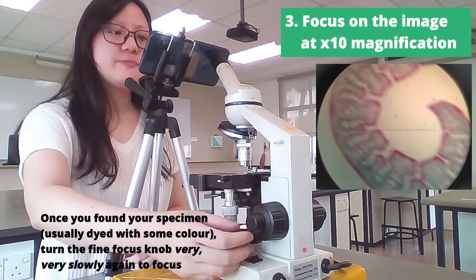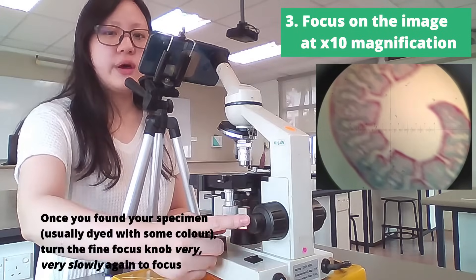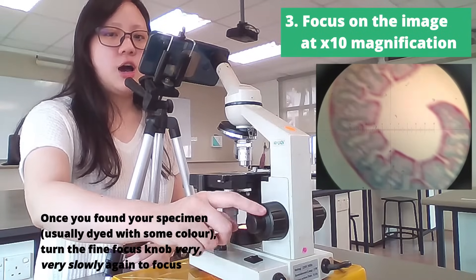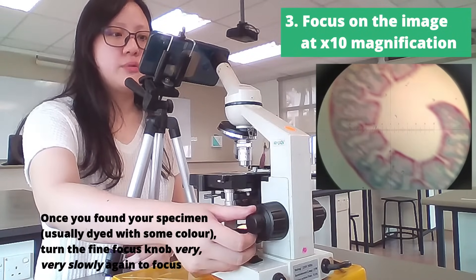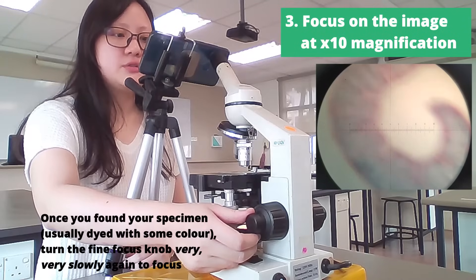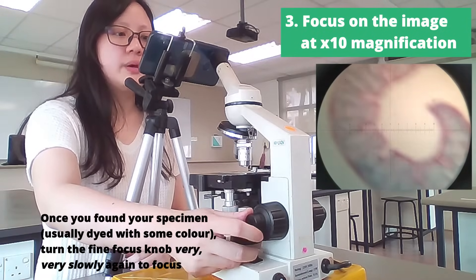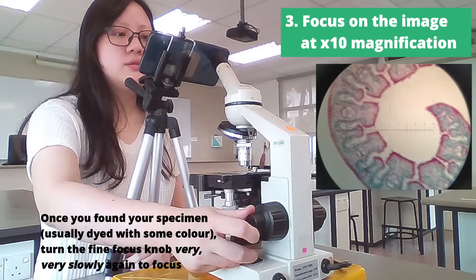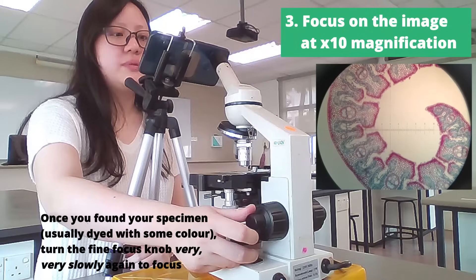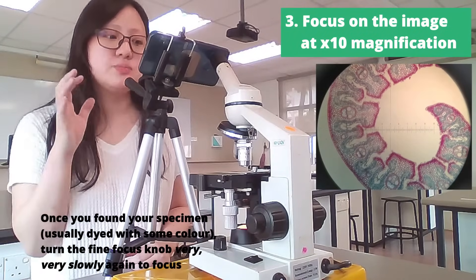Once we see the specimen, we realize that it's not exactly focused, so we go ahead and rotate this fine focus knob a little bit more towards you until it comes into focus. You can see it slowly come out of focus, so you turn back a little bit until it becomes completely clear. This is the specimen under 10 times magnification.